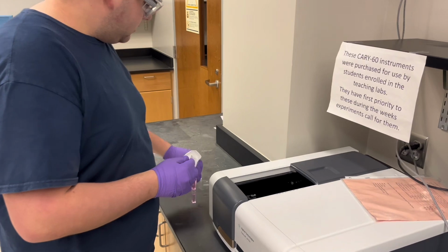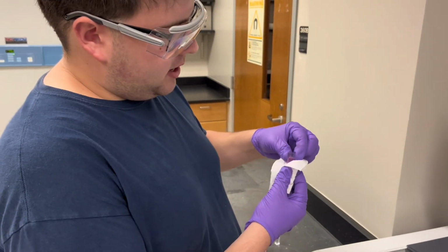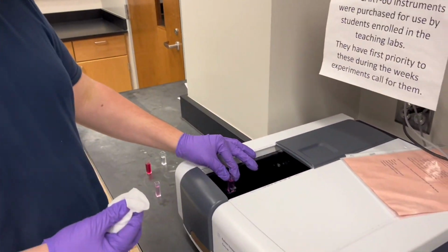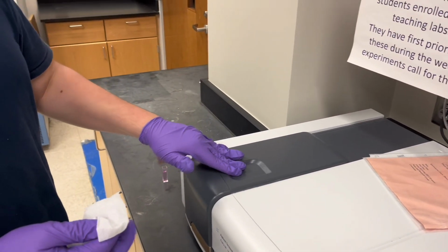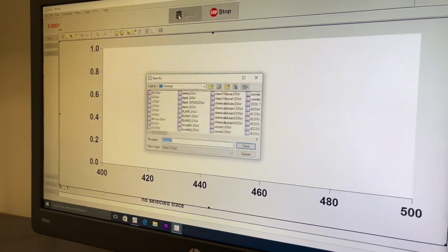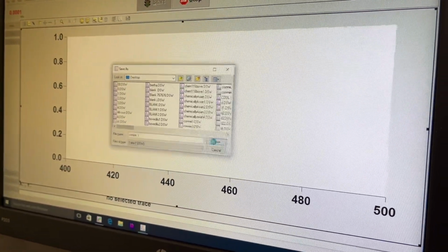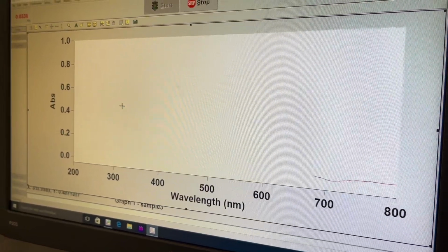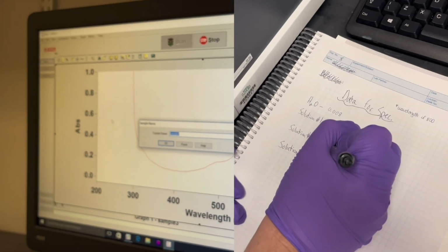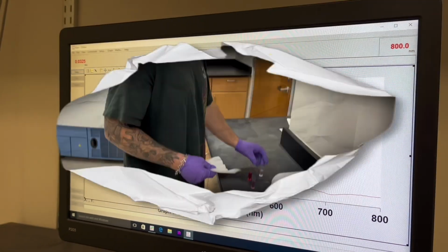that down. Let's get our sample that we're trying to measure here. Going to clean the sides again. Put it in like that. Close the lid. Going to go over here now. Going to hit start. Just going to call it sample 3. Let it read. And then we'll measure this absorption rate that's written up here.